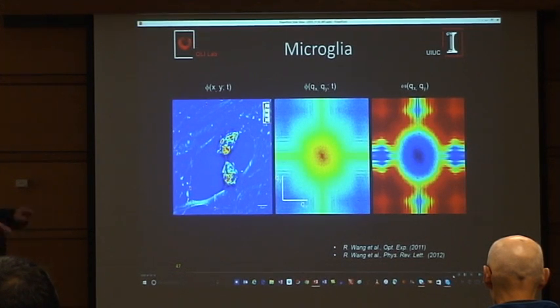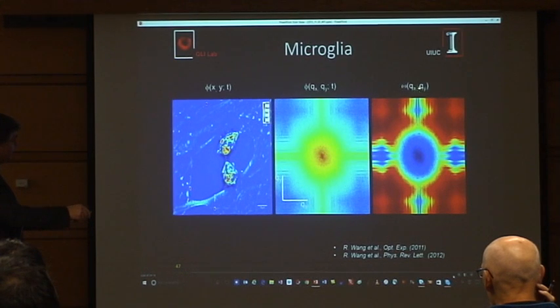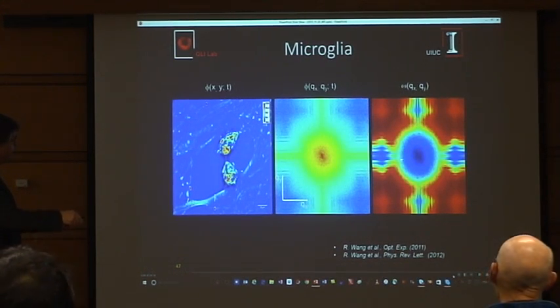If you take a Fourier transform of this in space, and you have one of those Fourier transforms at each moment in time, you can calculate the bandwidth in time and plot it at each spatial frequency qx, qy. At each point you have a bandwidth in radians per second, and these are the spatial frequencies qx and qy.